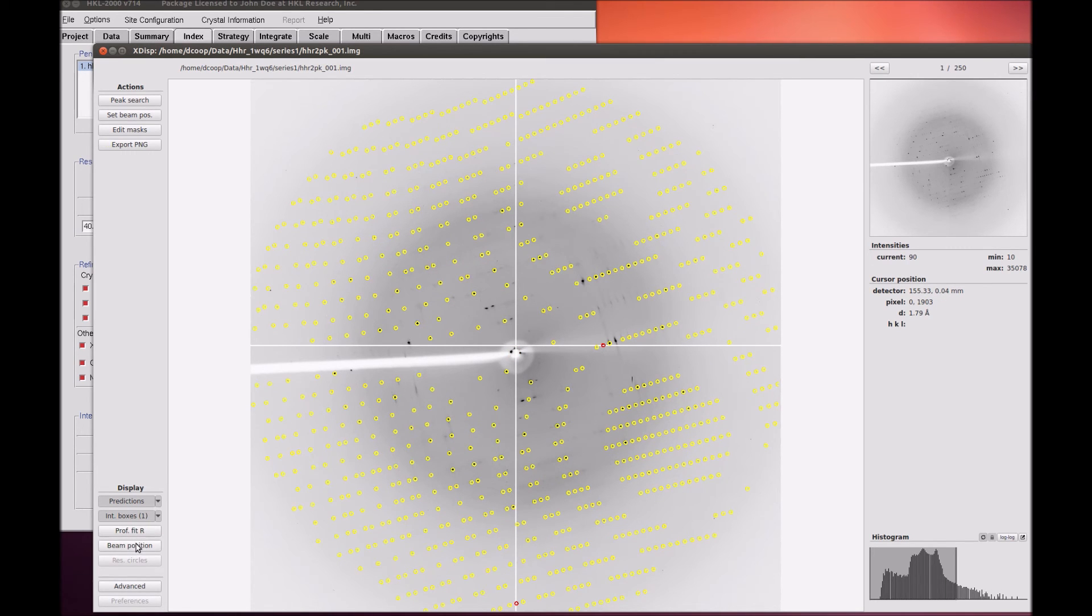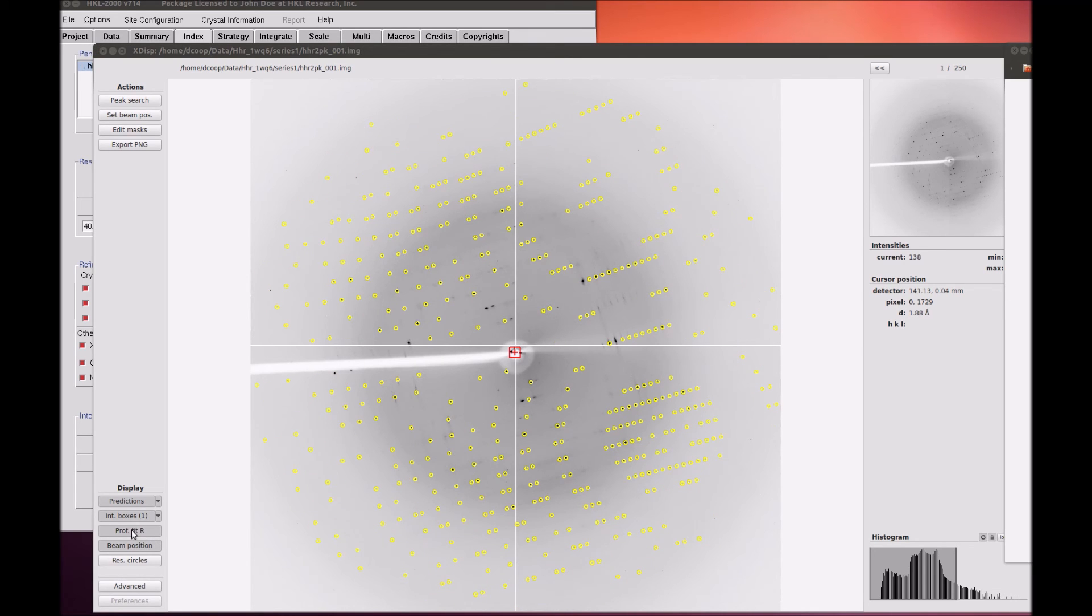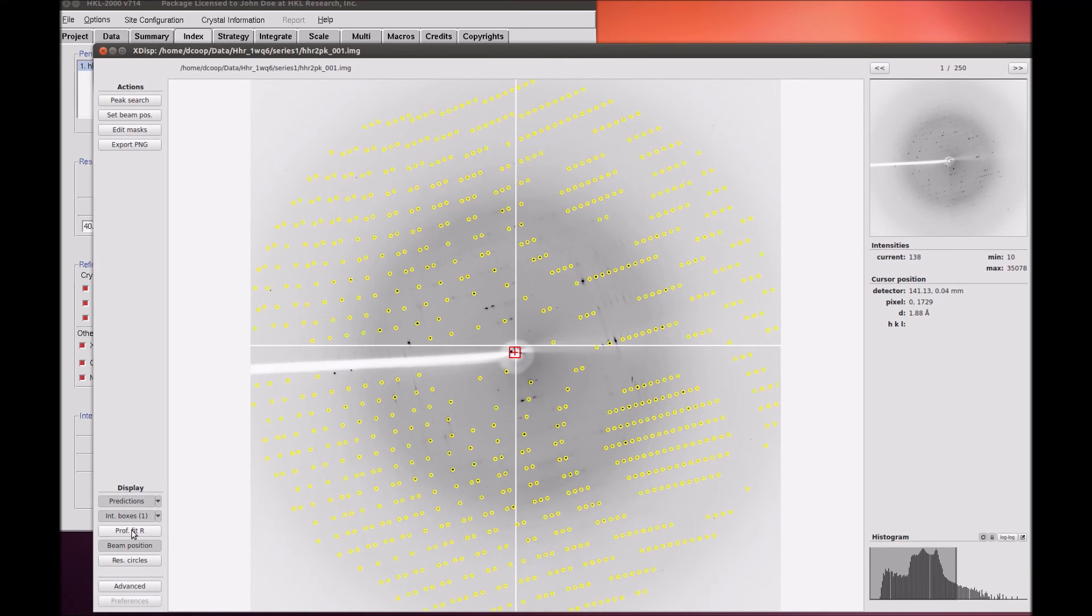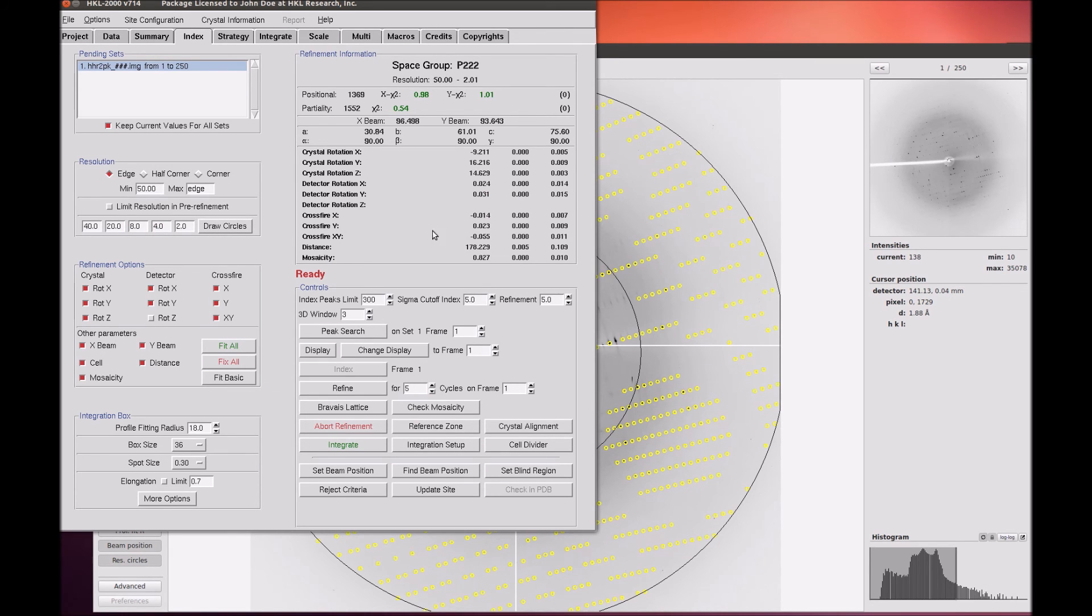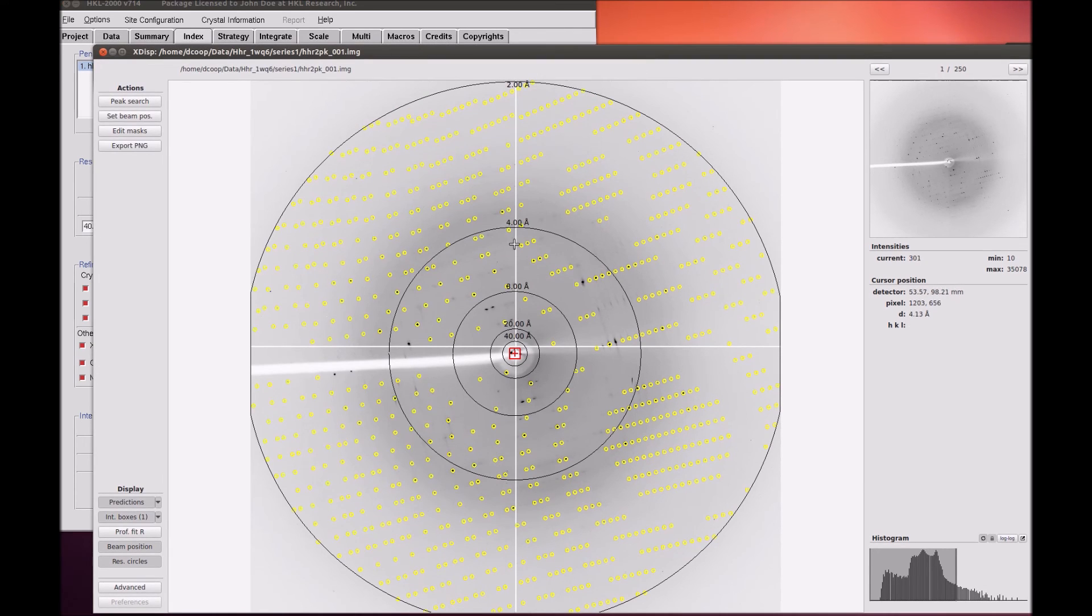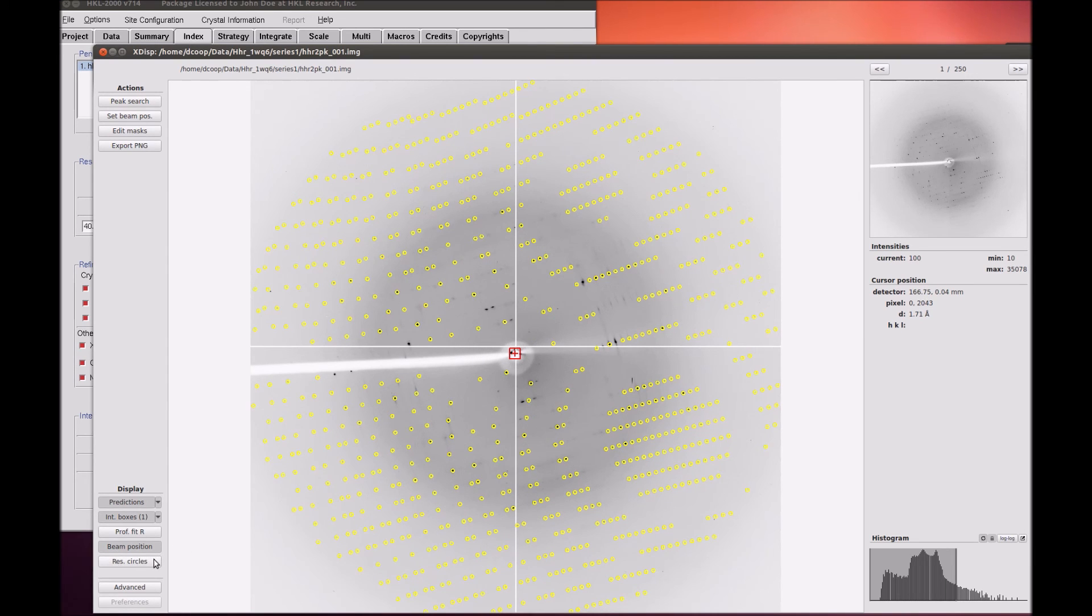The Beam Position button toggles the beam position crosshairs on and off. The Resolution Circles button is used to toggle the circles that show various resolutions. These circles are initially displayed from the main HKL window, where you can choose the resolutions you want to display.